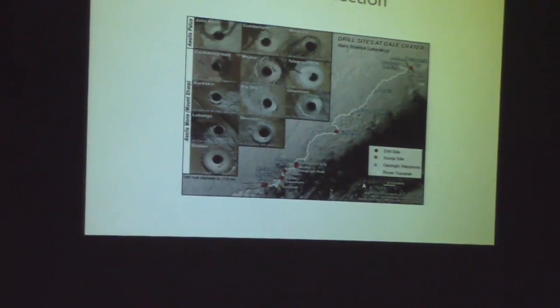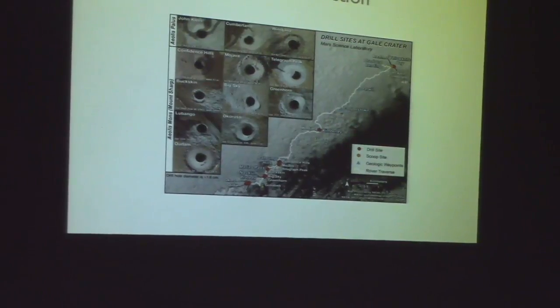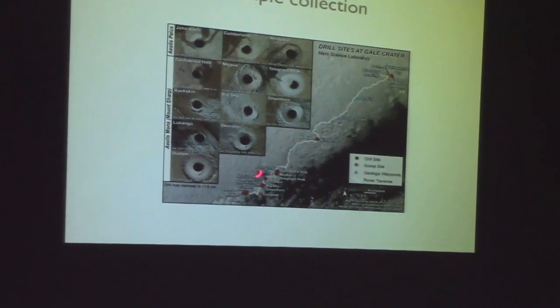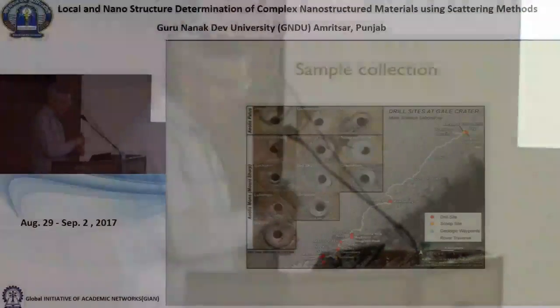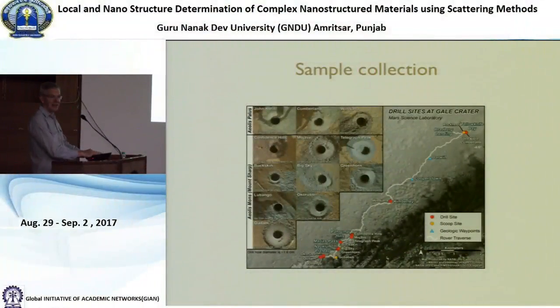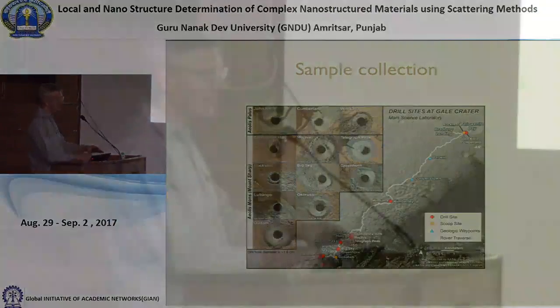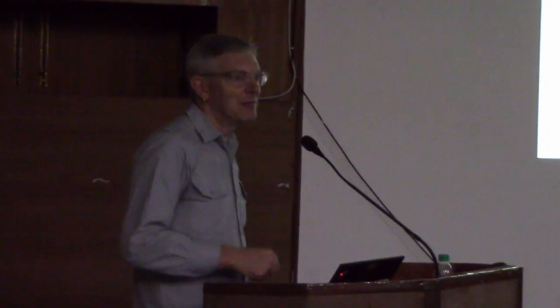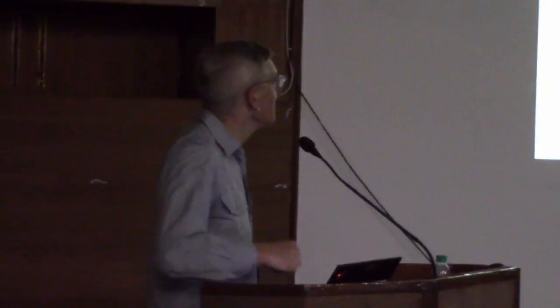After you've drilled the core, you have to pulverize it and turn it into a powder, and I don't actually know how they do that either, because this is not my work. It's just really cool. Then you have to make a sample. Usually we have a grad student do that. The grad student grinds the powder, puts it on a piece of paper, scoops it into a capillary, and taps the capillary. So how are you going to do that remotely on Mars with no grad student?